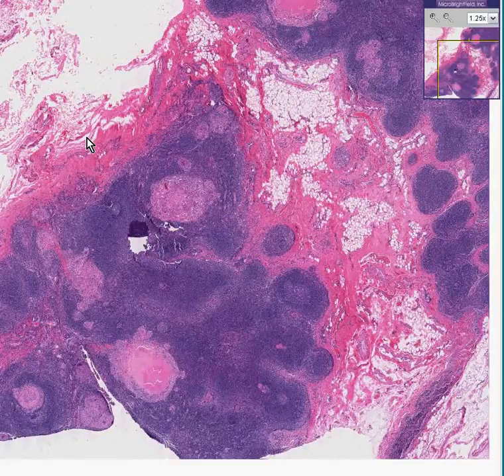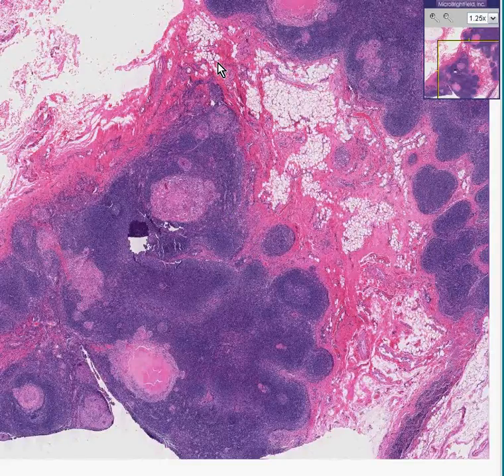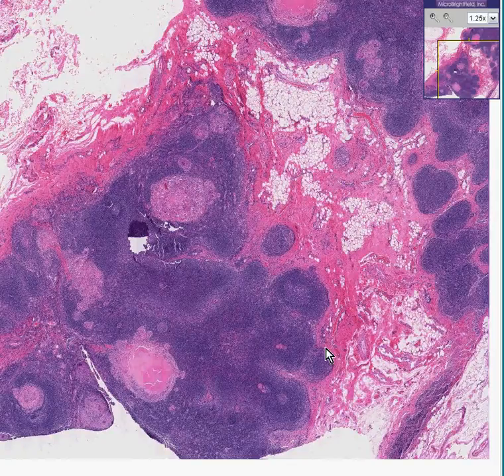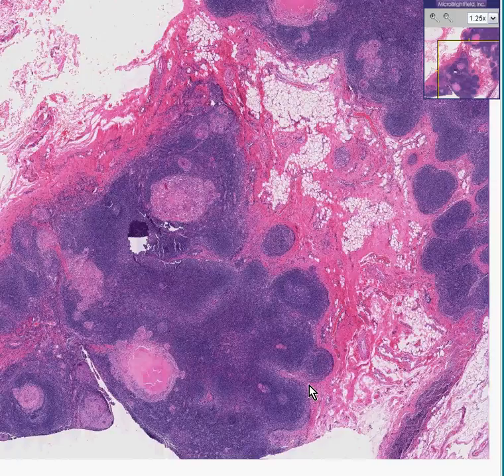You can instantly recognize this as being a lymph node. Here is some adipose and fibrous tissue surrounding the lymph node. Here is the capsule of the lymph node. Here are the follicles along the cortex.